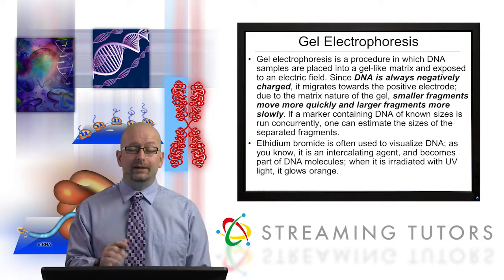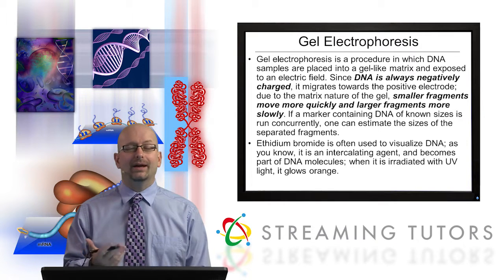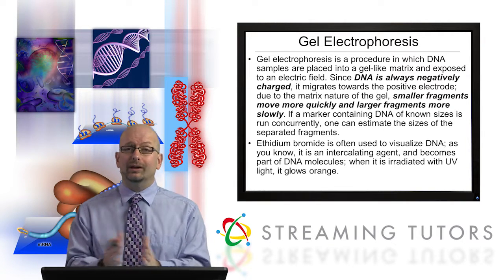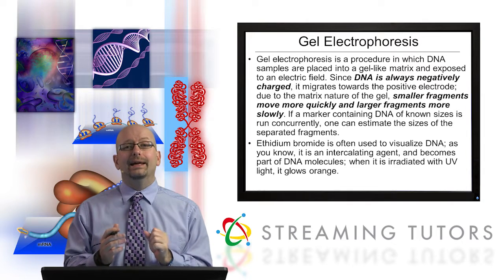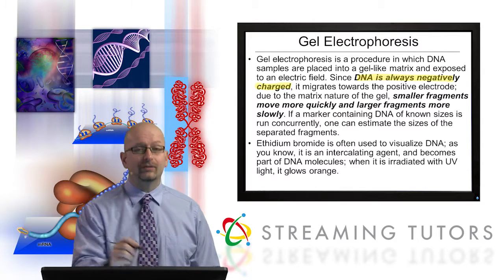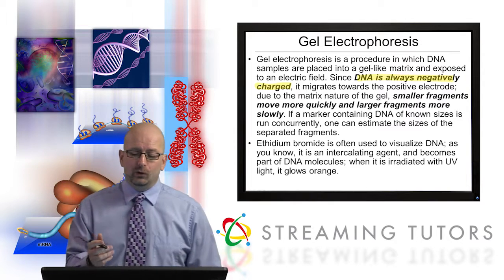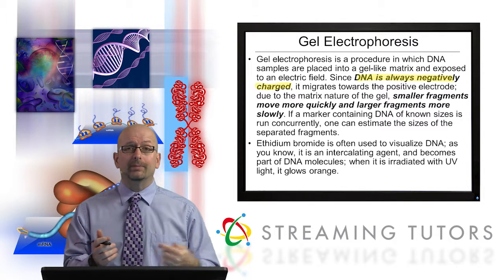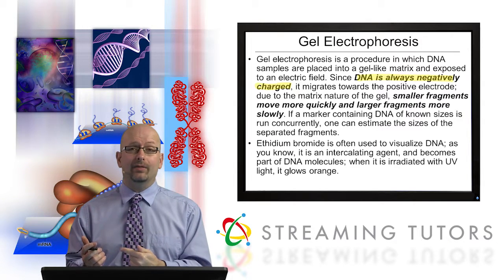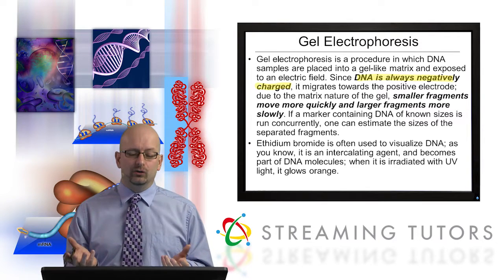Now, just as an aside, gel electrophoresis is a very important procedure. Almost every technique where you're doing molecular level things, gel electrophoresis is a part of it. It relies on the fact that DNA is always negatively charged, as it's an acid and there are all those negatively charged phosphate groups around. So if you put it in an electric field, pieces of DNA will always migrate toward the positive electrode, the anode. Now, if you just put them in water and did that, they'd migrate, but it wouldn't do you any good because you couldn't see them.